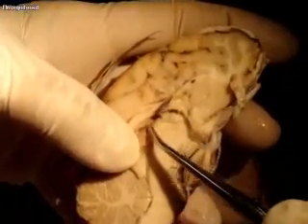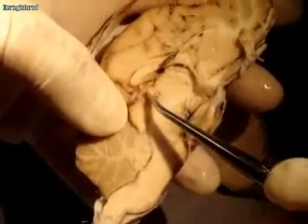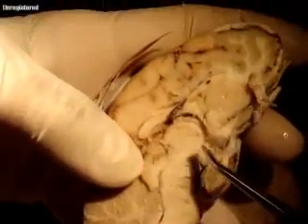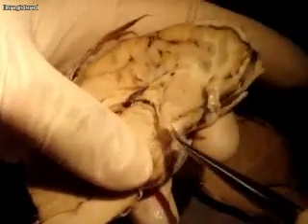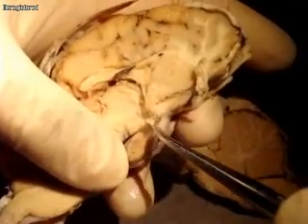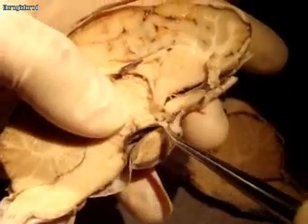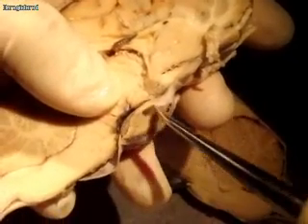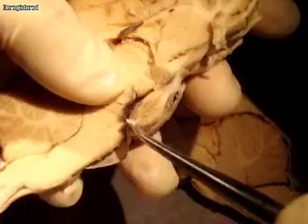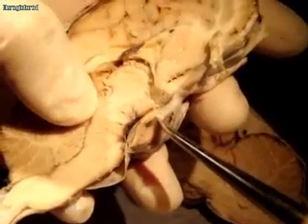So then, looking here again, so once again, here's your thalamus. If you remember, this part was called the epithalamus. Remember that in today's lecture? And then right here is a little region that's called the hypothalamus. And from the hypothalamus, there is a little projection called the infundibulum. And the infundibulum, it's right there, connects the hypothalamus with the pituitary. It directly connects it with the posterior pituitary. This is posterior. This is the anterior pituitary here in the front.